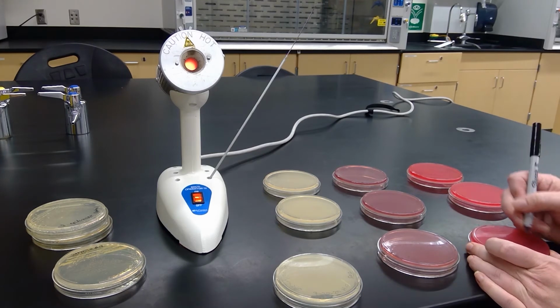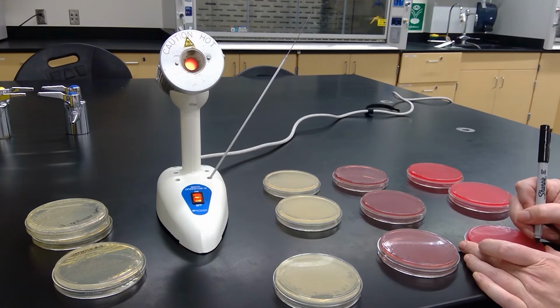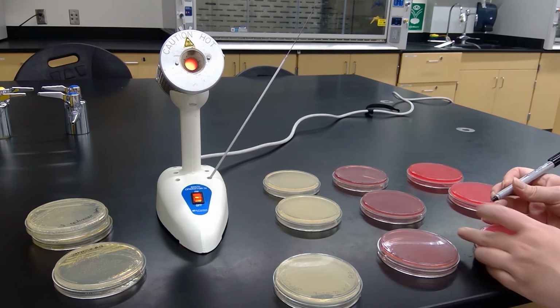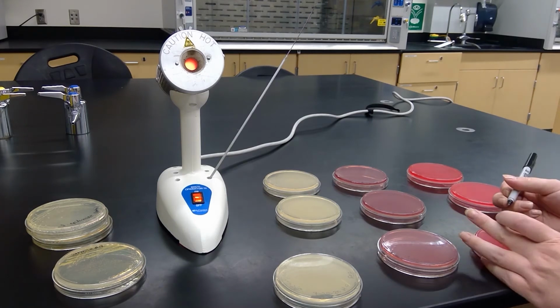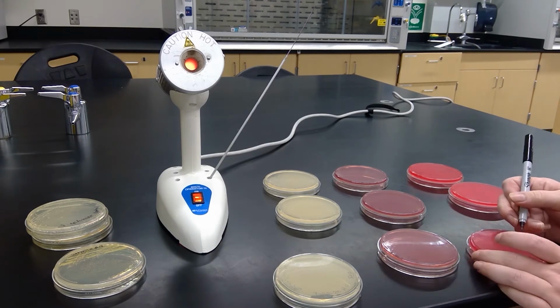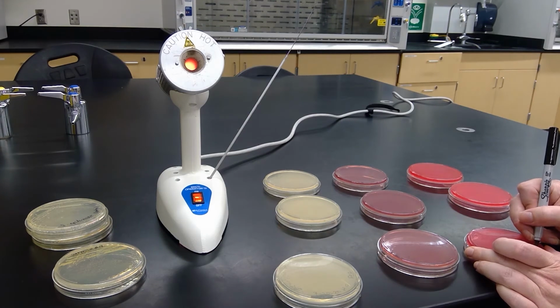So we'll start with the staph epidermidis, the date, my initials, and then this one is MSA.